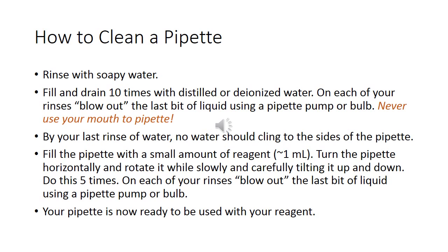By your last rinse, the only liquid that you should have to blow out of your pipette should be at the very bottom. The sides of your pipette should have no liquid clinging to them if they are truly clean.